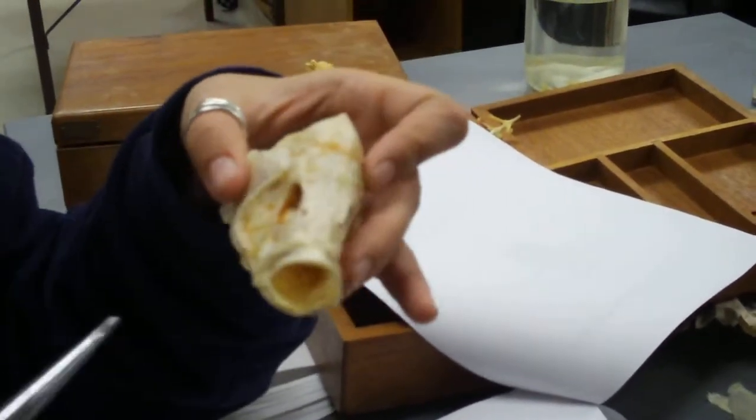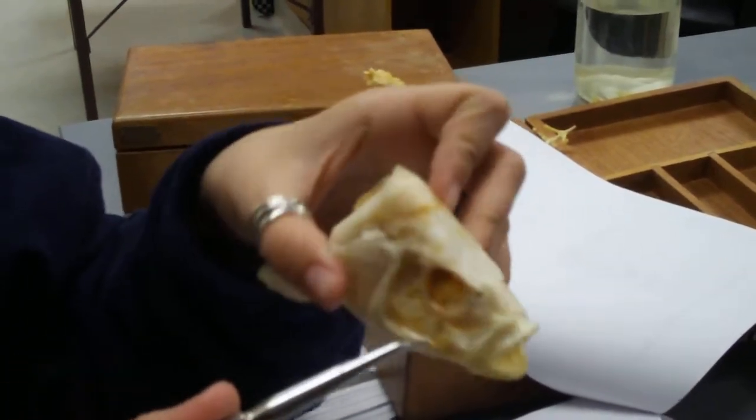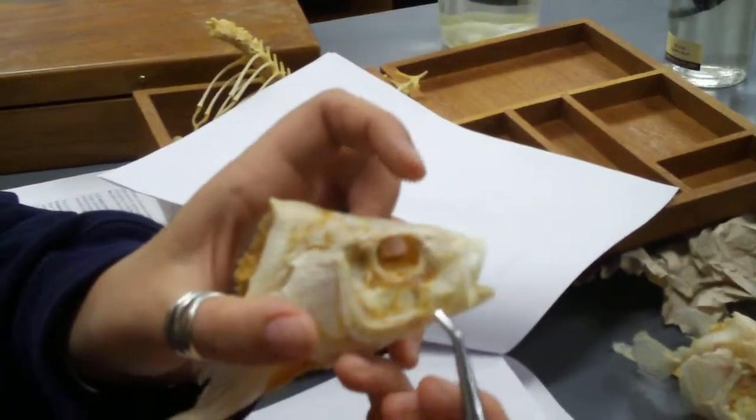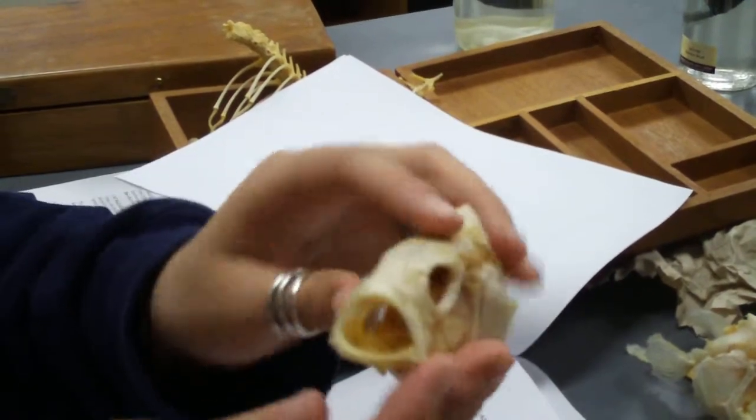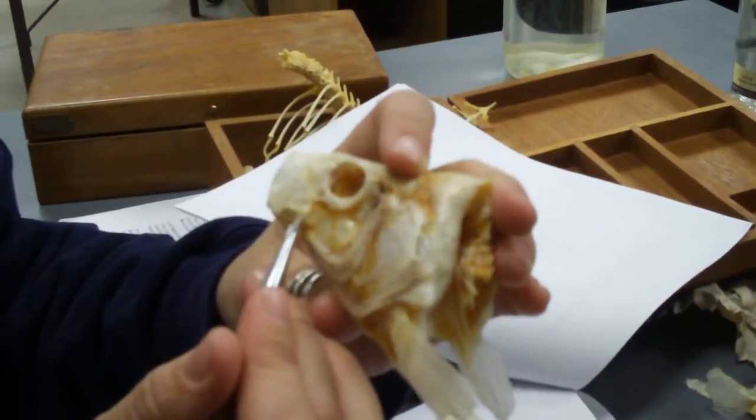Articular is right here. I'll double check that on the nice picture.